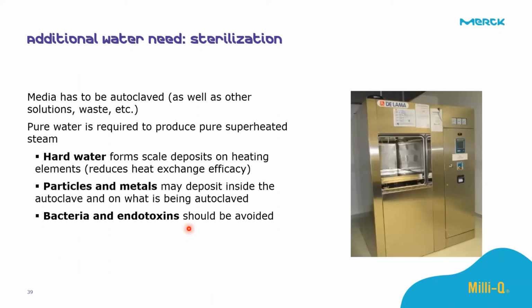Finally, looking at when it comes to sterilization, media has to be autoclaved, of course, as well as other solutions and waste. So pure water is required to produce pure superheated steam. This means that the water that is used to fill the autoclaves should be purified water.